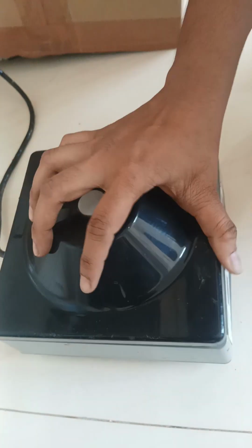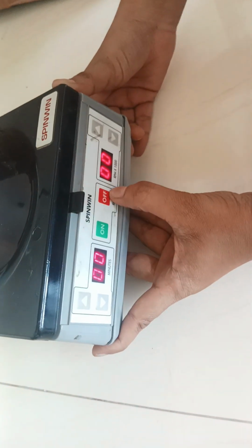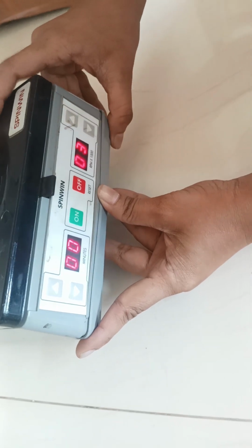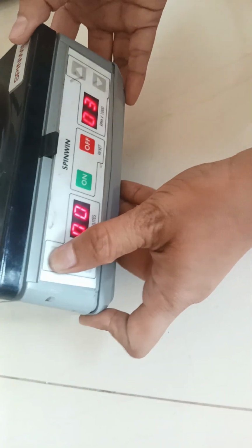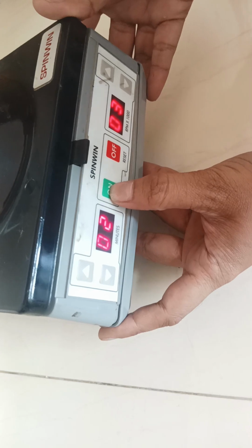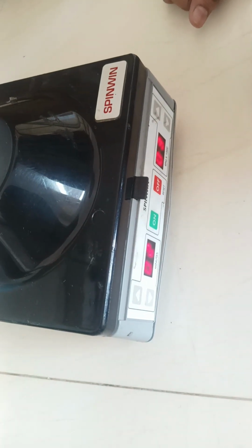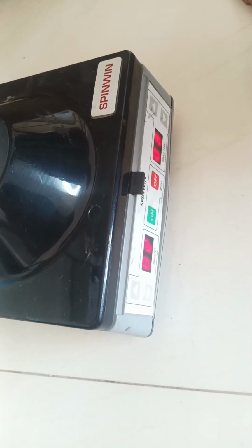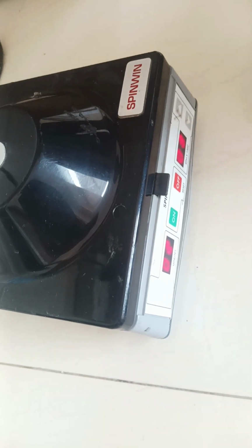Now I am going to close it and switch it on. I have to set the RPM first. 1, 2, 3. I have set it as 3, that is 3 into 1000, which is 3000 RPM. The timer I want to set as 2 minutes, for example. Now I will press the on button. So it has now started. It will give a beep after 2 minutes. Then you have to remove the samples and see whether your contents are separated or not.